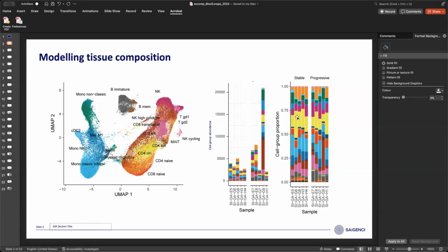But nonetheless, if we sum to one, so we pretend that that's known, you can obviously see the proportional distribution of the different cell types, and the goal is to understand between two conditions whether a cell type is more abundant than in another condition.